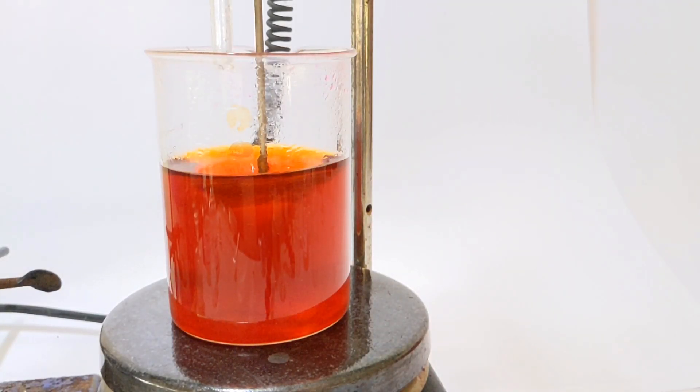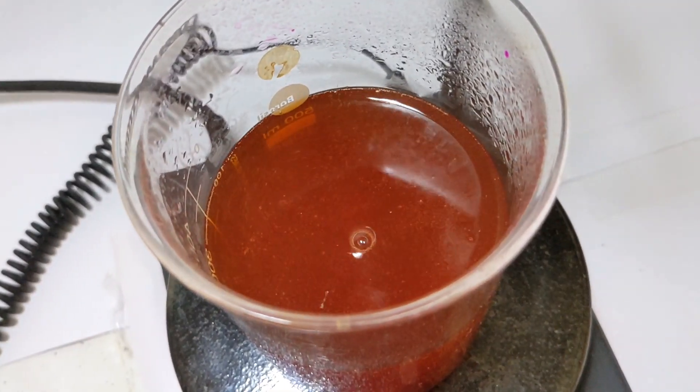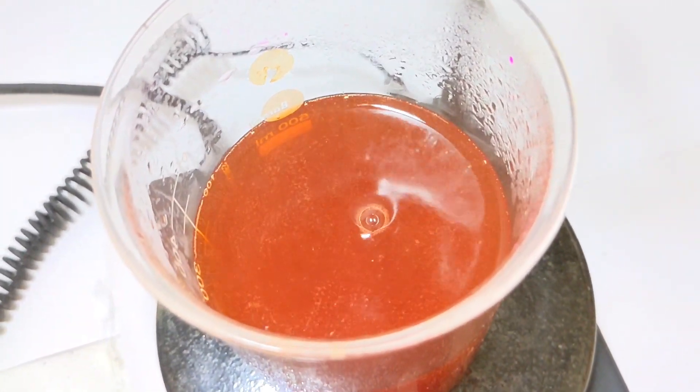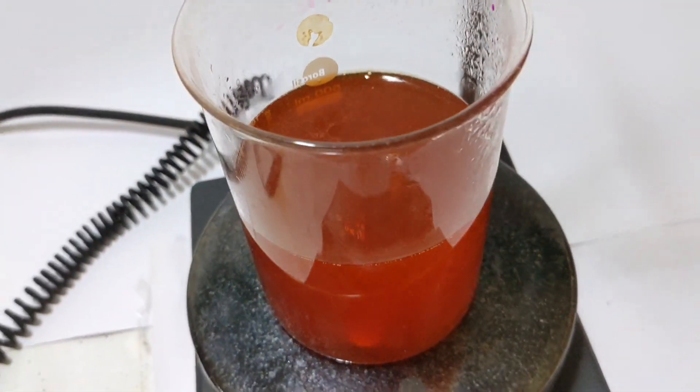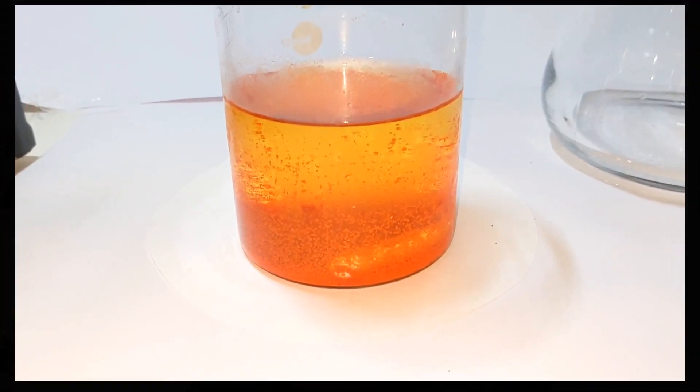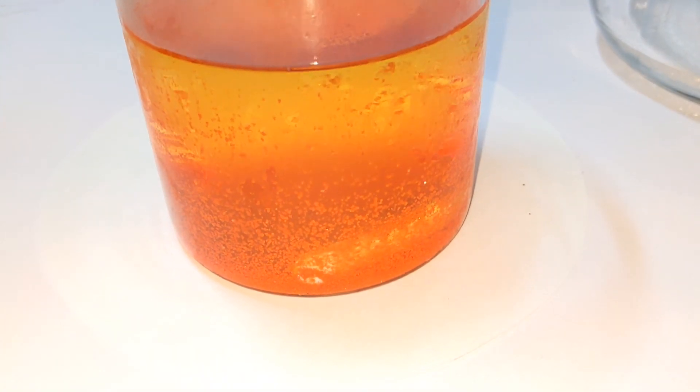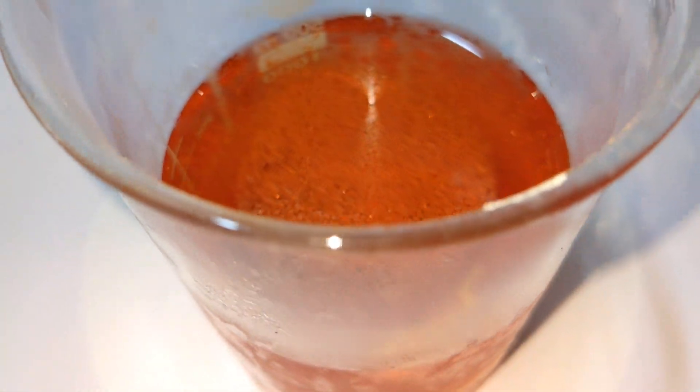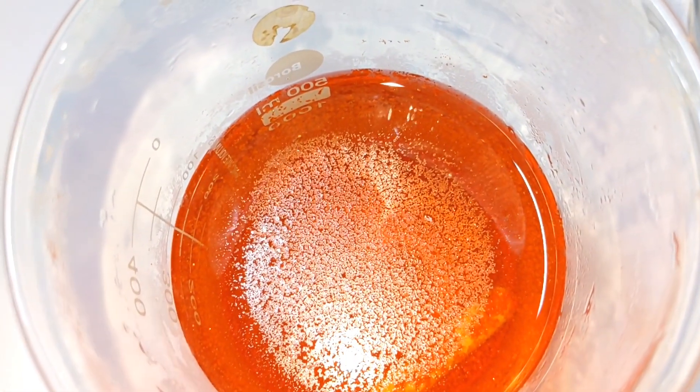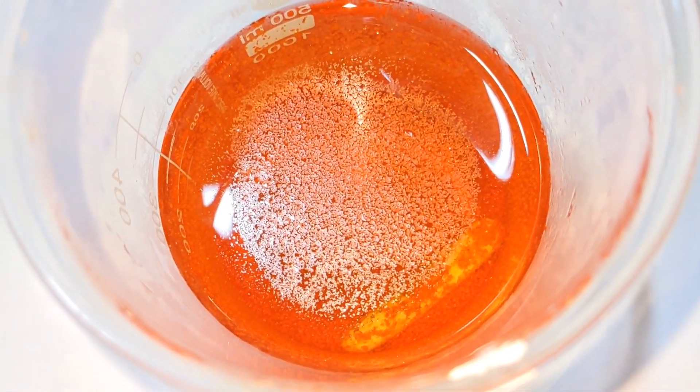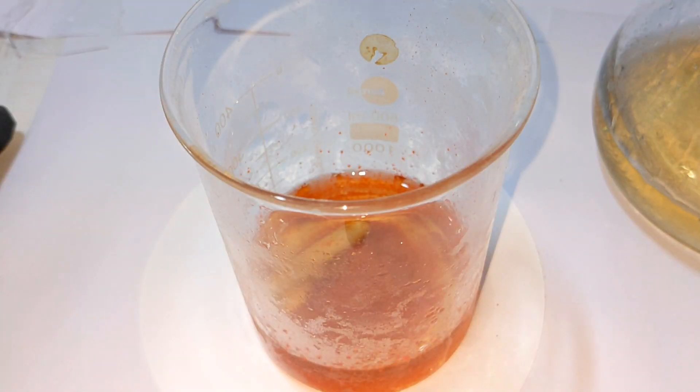Heating was then stopped and the beaker was allowed to come down to room temperature. By that time some of the crystals already started precipitating out. The beaker was then placed in refrigerator overnight and as you can see, a lot of crystals came out of the solution. Many crystals got stuck onto the walls of the beaker and they were also scraped off using the flat end of a metal spatula.